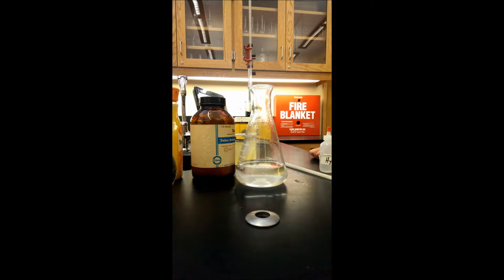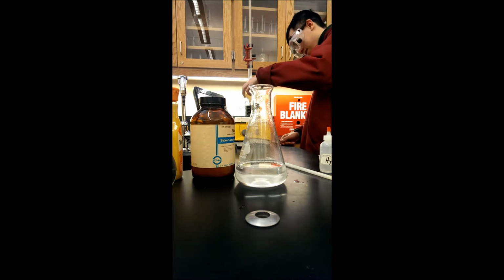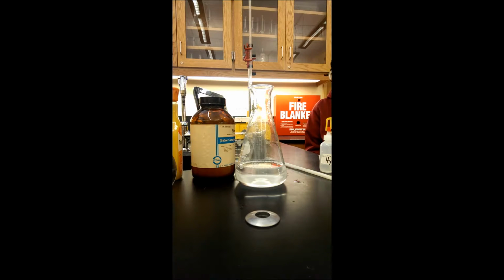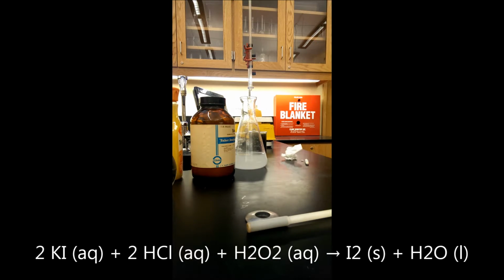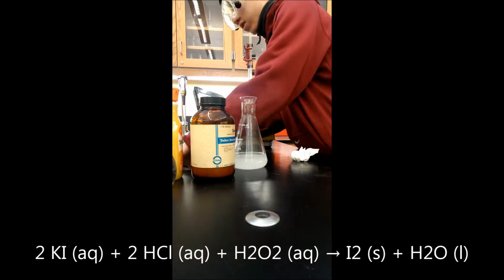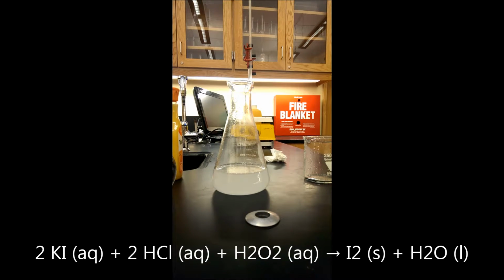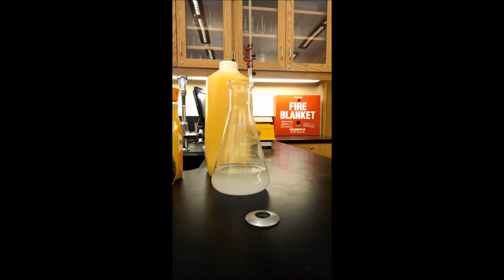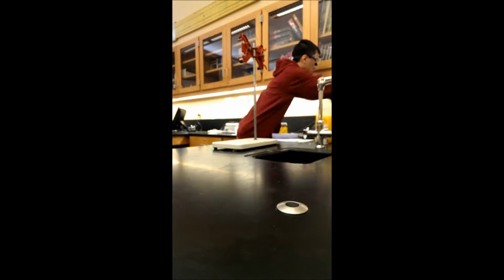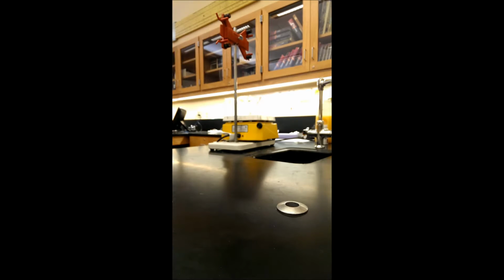And so there I added in hydrochloric acid and hydrogen peroxide, and this reaction pretty much guarantees that you'll get iodide ions, and then they'll form iodine. And so that was going to be the basis for the new experiment, which I'm doing here on the next day.